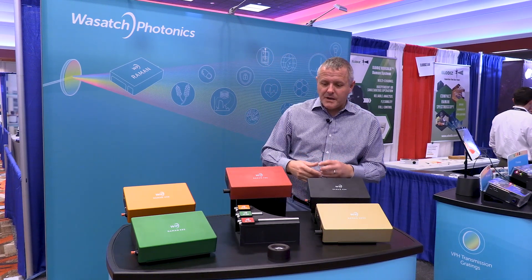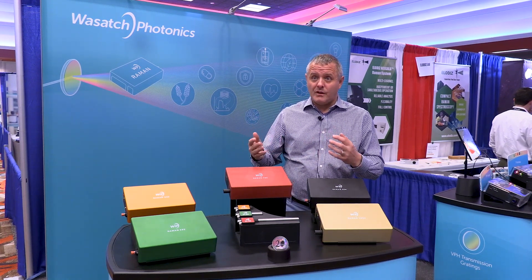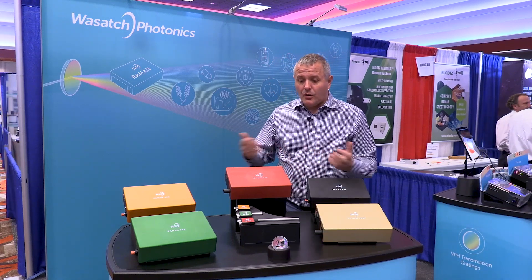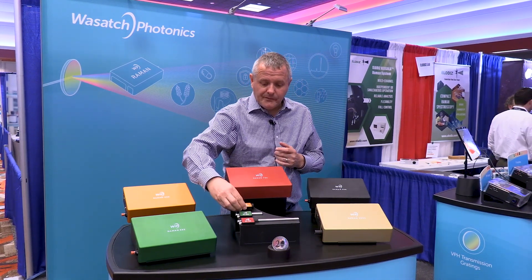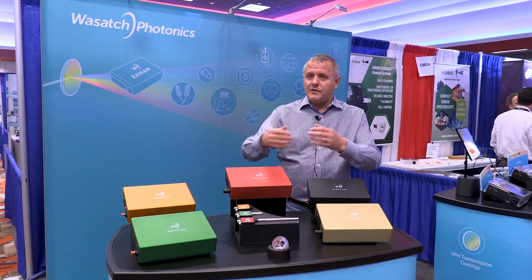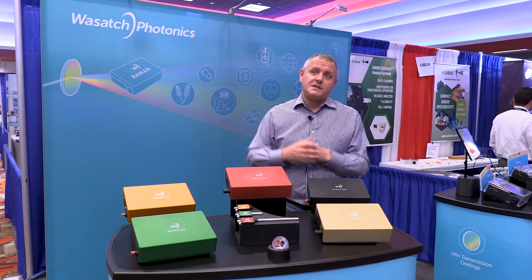The final aspect is how you interface with a sample and your choice of laser. We offer the user the ability to use their own laser or to have the laser integrated into our system, controlled fully through our software. How we interface with a sample is the most important thing — we can either have an integrated probe as you can see here, or use different external probes. Whether you want to couple it into an existing microscope, do traditional bulk measurements, industrial measurements, or accessories for lateral flow, we offer that configurability. So we've got the sensitivity and the configurability, and aligning that with point-of-use detection is why this product line exists.